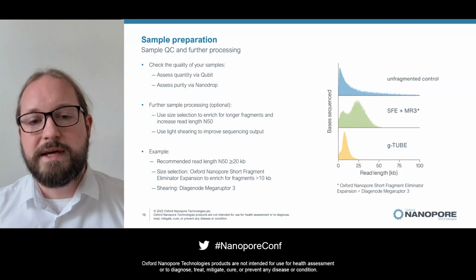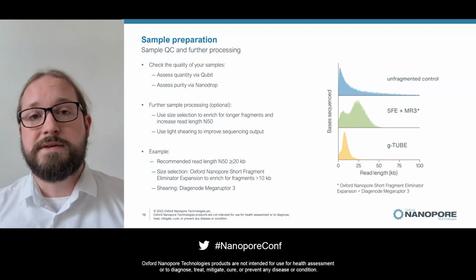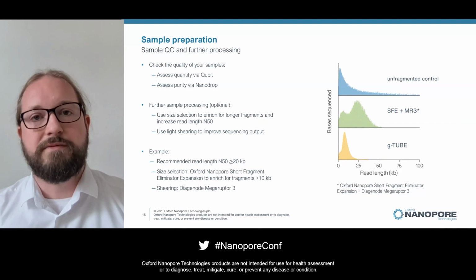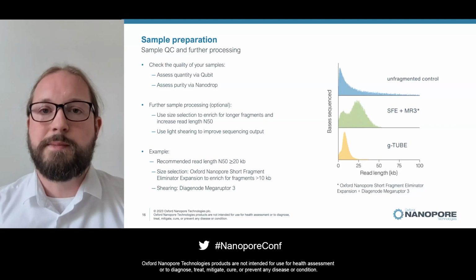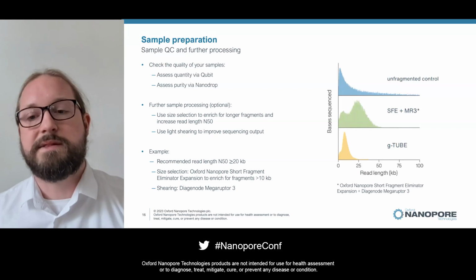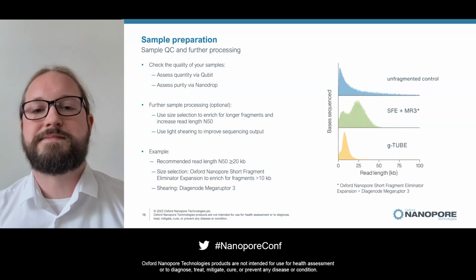Overall, our recommendation would be light shearing and size selection. But again, it really comes down to what you get from QC. You need to look at your sample and make these decisions. And I'll show you an example of us doing that later in the worked example.